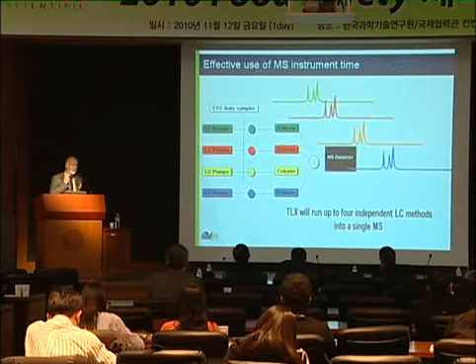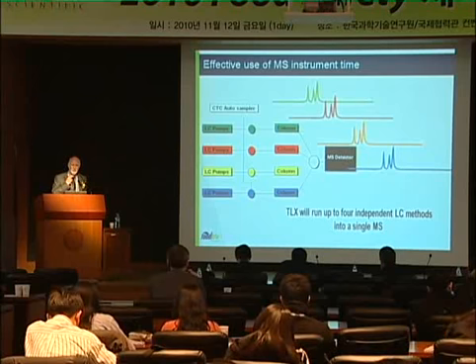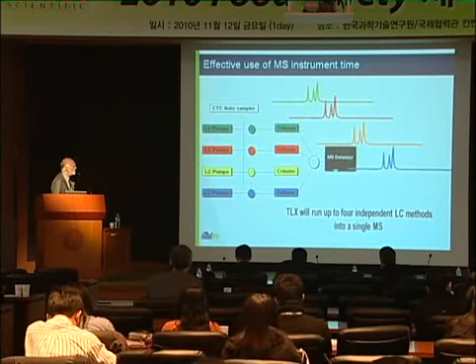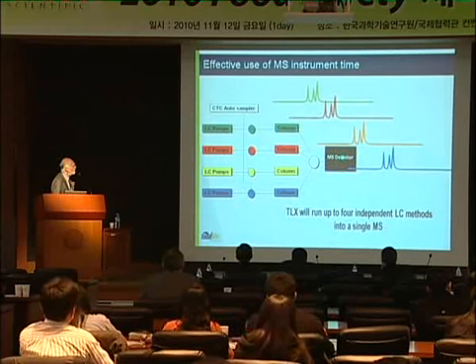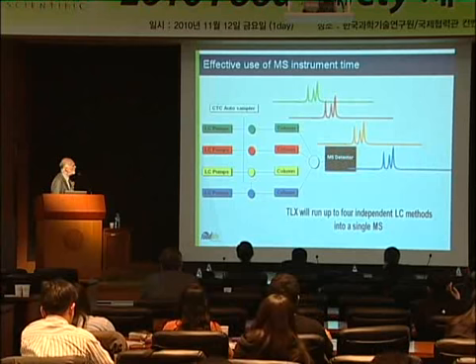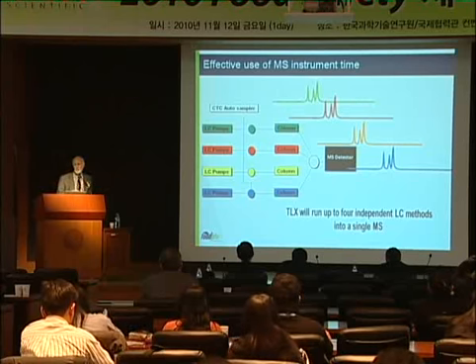Another way in which you can make quite big savings in the laboratory is by making more effective use of expensive instrumentation. So in this example, we've got an MS system, and for this analysis of nitrofurans, there's only 3 peaks in the run, and these peaks elute over 3 or 4 minutes, but the total HPLC runtime might be 45 minutes.